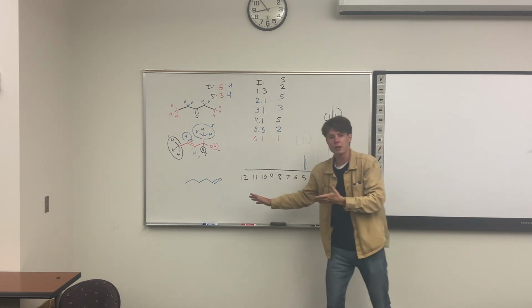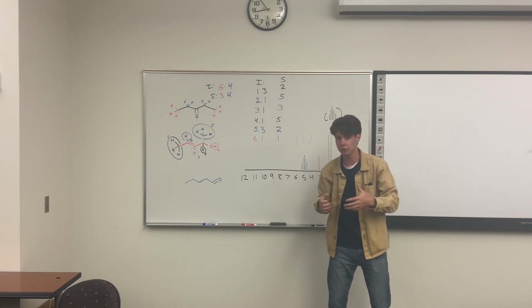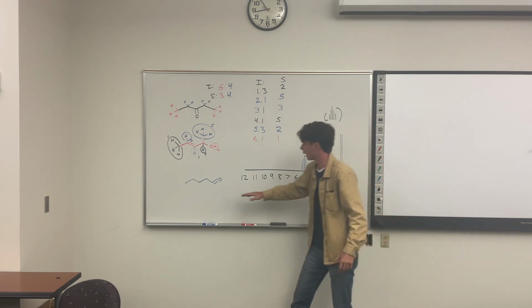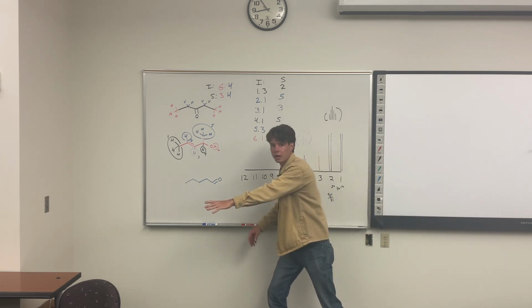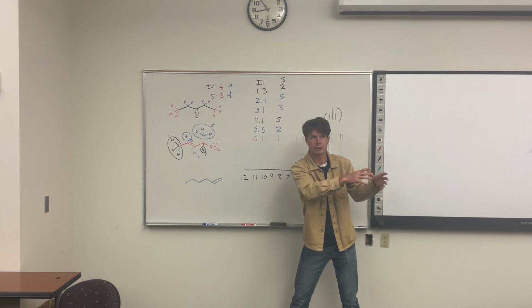With experience, I can look at that and I can probably circle an answer at this point. Just because I'm used to doing spectra, I can see aldehydes way over here on 10, there's 1 signal. All these are going to be low or high signals, but stumpy.